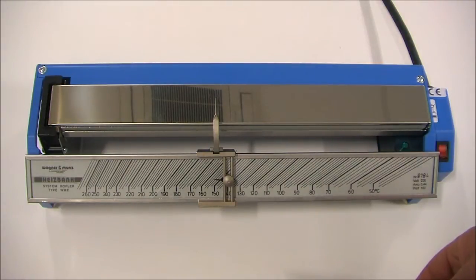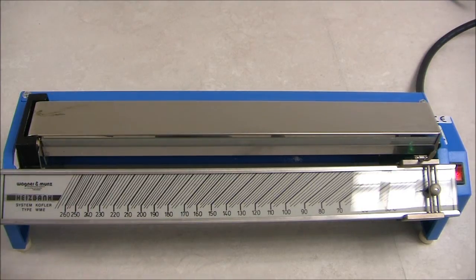But let me take you down to our lab and show you what it can actually do. So here we are in the lab. I'll show you how this thing actually works.